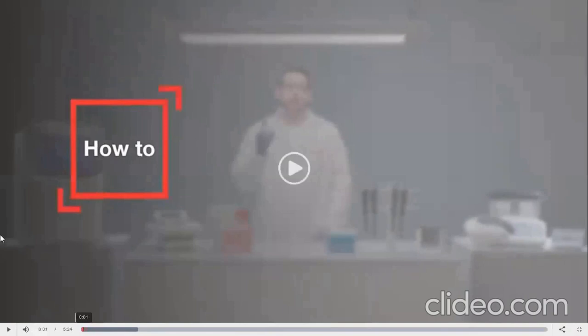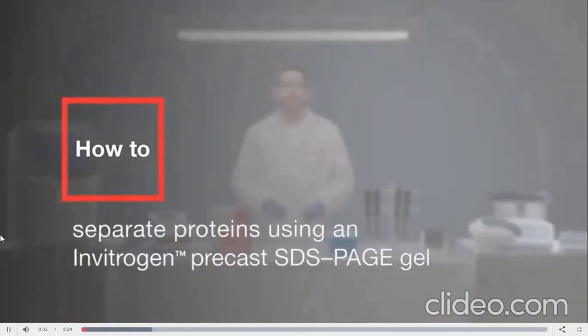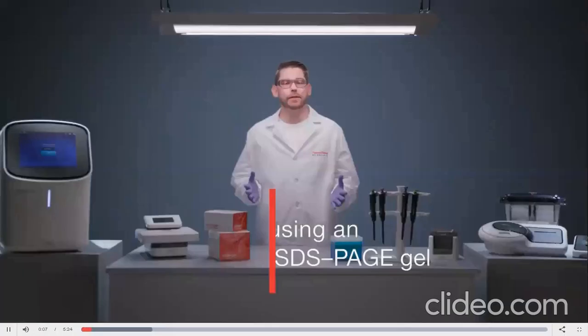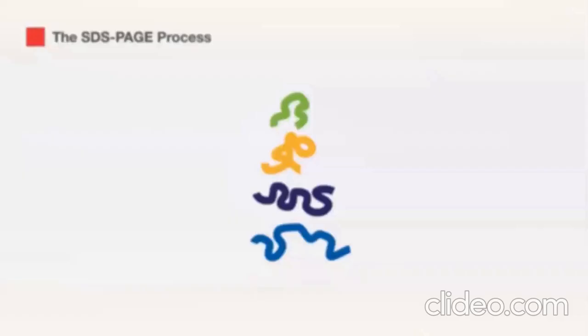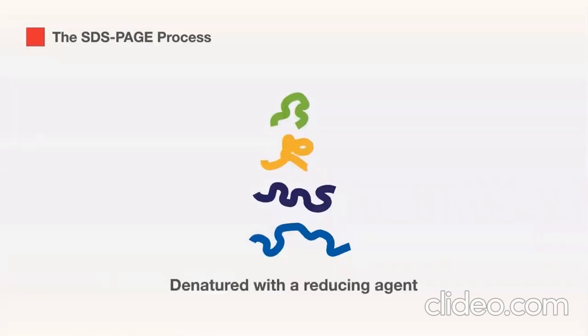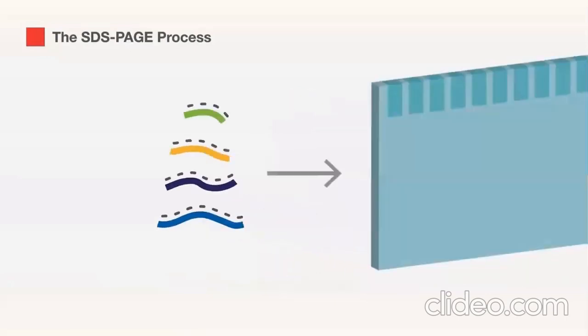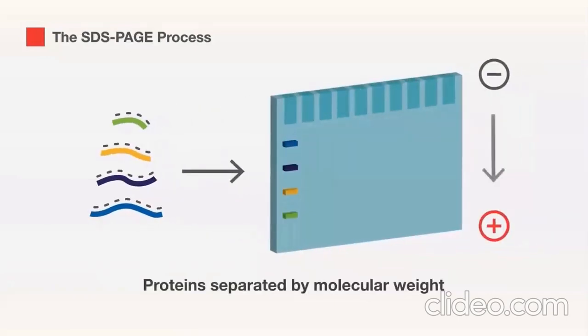Including Western blot analysis. A step in many protein analytical methods, including Western blot analysis, is to separate proteins by gel electrophoresis. The most widely used protein electrophoretic technique is SDS-PAGE, in which proteins are denatured and evenly charged by an ionic detergent so that protein migration through the gel is based only on their size.